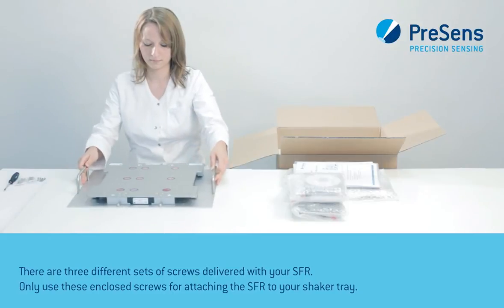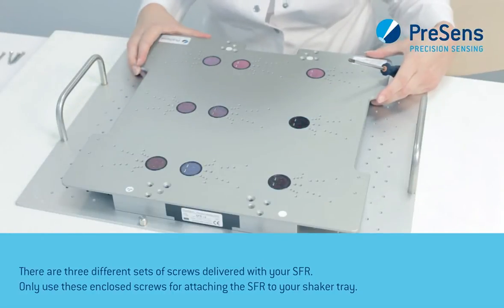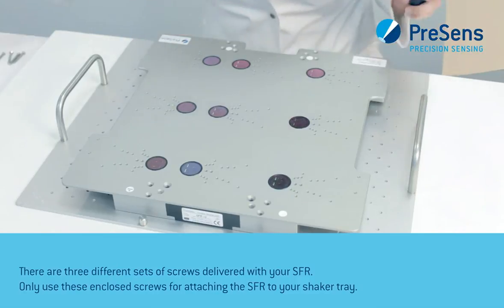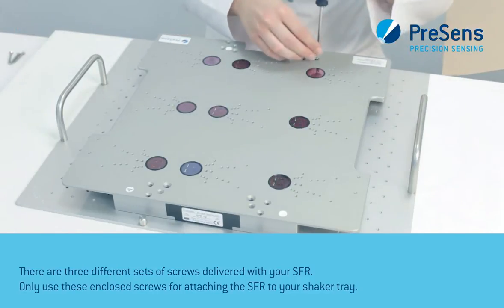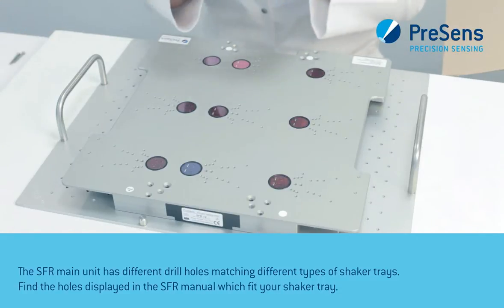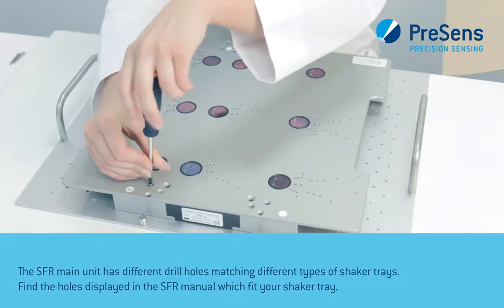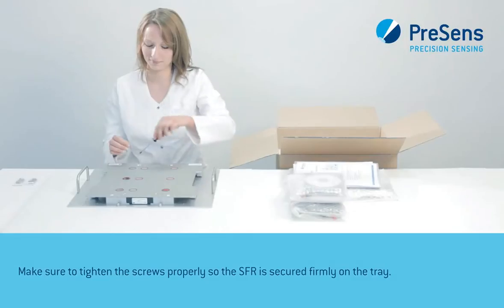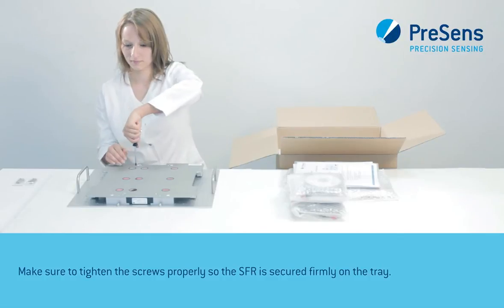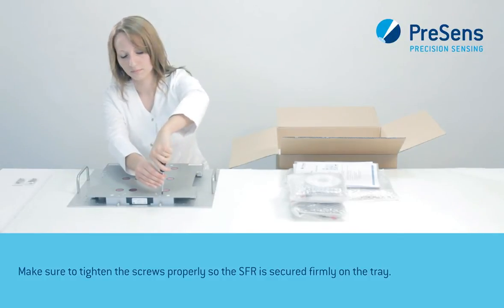There are three different sets of screws delivered with your SFR. Only use these enclosed screws for attaching the SFR to your shaker tray. The SFR main unit has different drill holes matching different types of shaker trays. Find the holes displayed in the SFR manual which fit your shaker tray. Make sure to tighten the screws properly so the SFR is secured firmly on the tray.